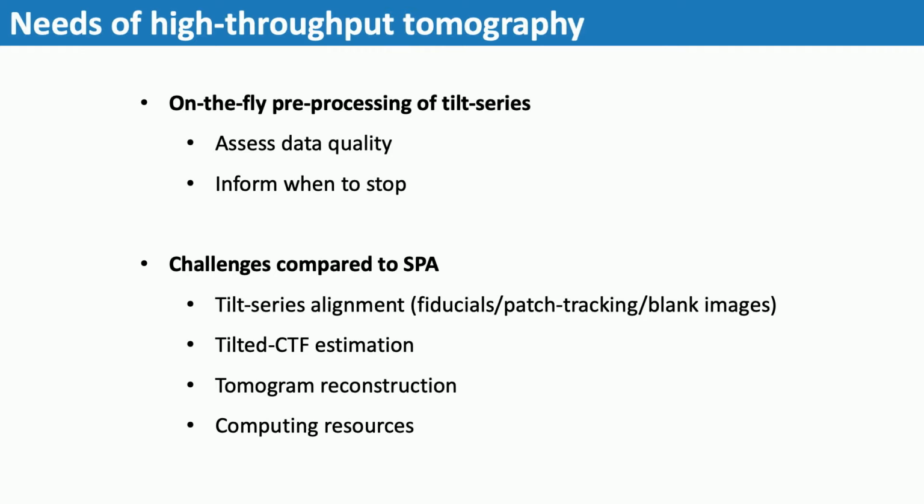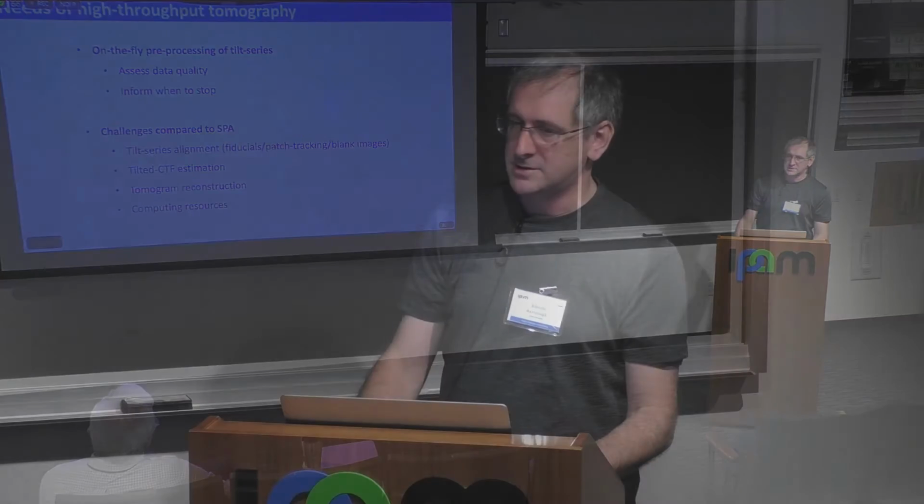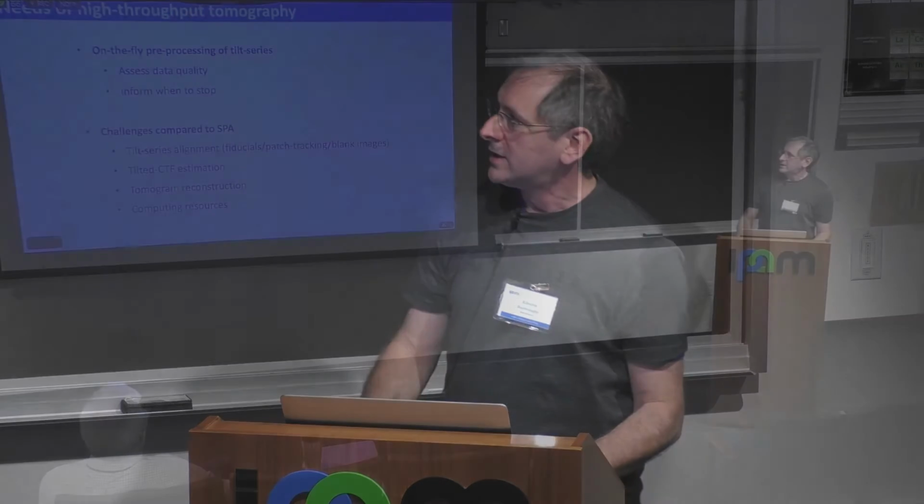Okay, so that's all nice and fine, but the first time we ran this for 2 days and we got this many tilt series, we realized how big of a problem we had gotten ourselves into, because we just didn't know how to handle 1,000 tilt series, right? So the first thing that we realized is that you need to be able to process these tilt series in an automated manner, because otherwise nobody can do this manually on 1,000 tilt series.